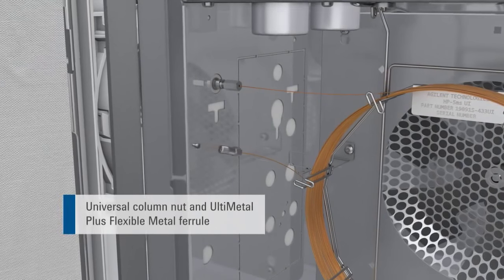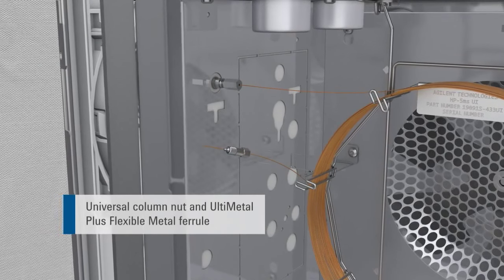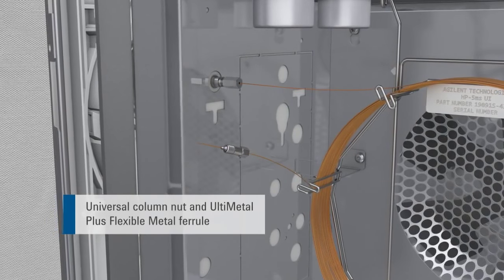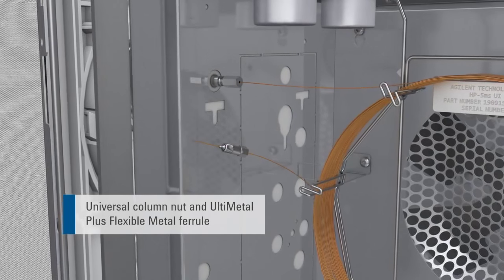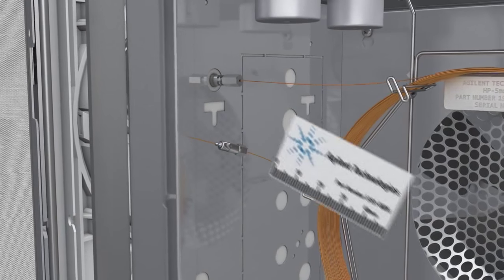Thread the column through the nut and flexible metal ferrule. A septum is not needed to mark the required length of column since the flexible metal ferrules permanently grip the column when pre-swaged.